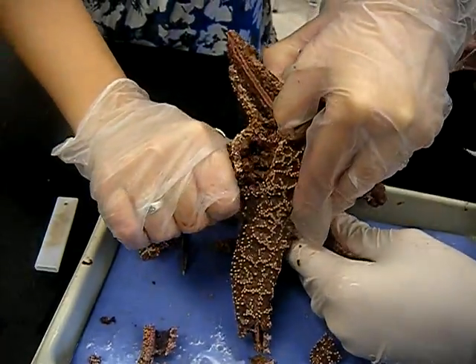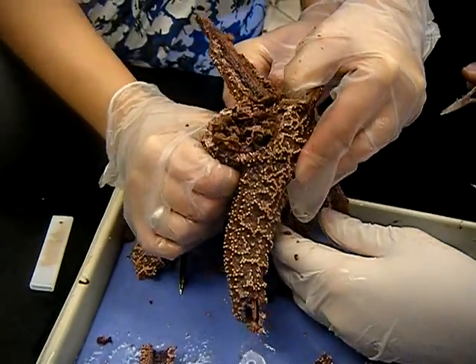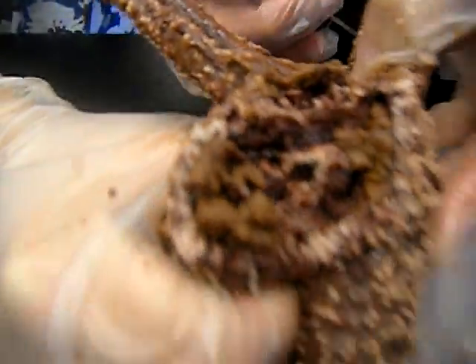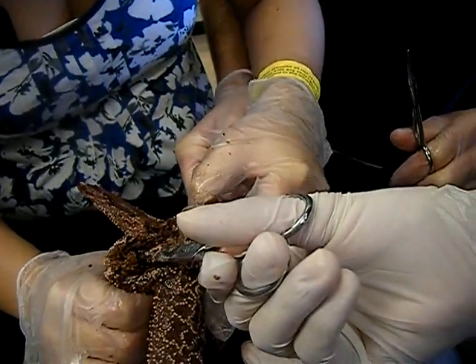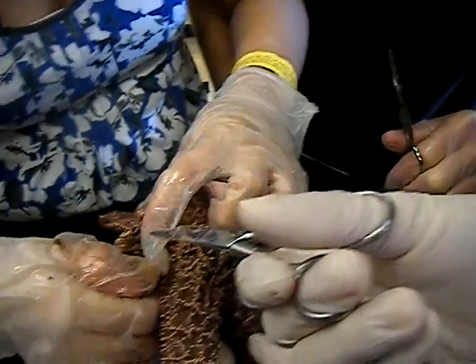Come on, let's see that stomach. Look, there's a leg. There's a leg. We've got gonads. We have gonads. We do have gonads too. I love gonads. They're right there. Yummy.